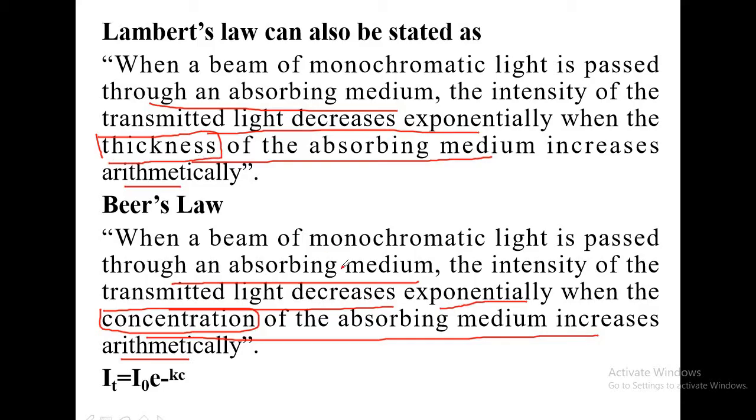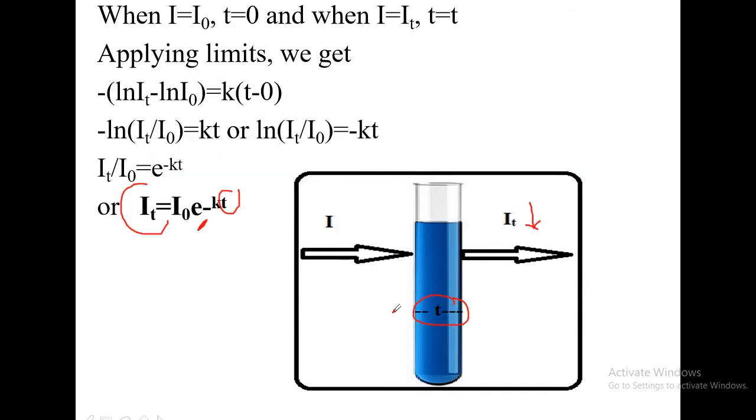So Lambert's law and Beer's law, things should be very clear. According to Lambert's law, as you increase the thickness of the absorbing medium, the intensity of the transmitted light goes on decreasing.